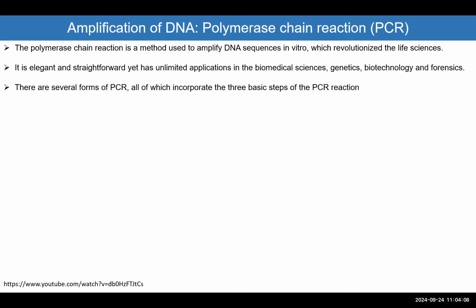I mentioned before that restriction enzymes really made a revolution in molecular biology, and then the PCR was also the second component that made a big change in molecular biology, because you can amplify and modify any piece of DNA, any fragment of DNA, the way you like. It's very easy, very smooth, very elegant, and it can be done within 1 hour to 2 hours based on the experiment. It's cheap as well, so it can be used to perform multiple analyses, and it's not going to be costly.